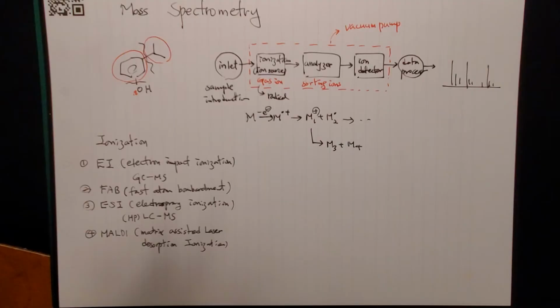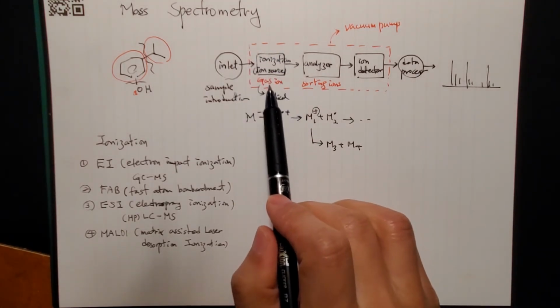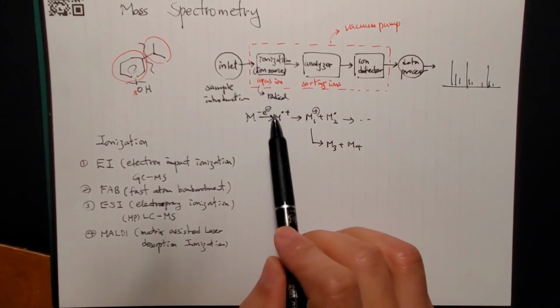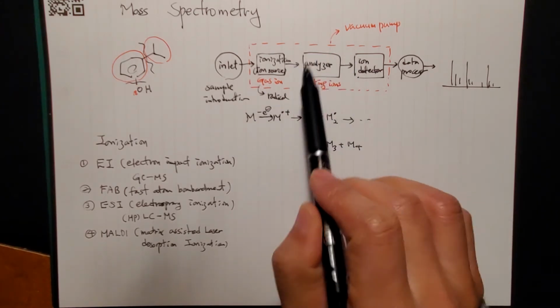This is one of the typical MALDI sample plates. MALDI is one of the latest advanced technologies, and you may find it in the lab most frequently. MALDI normally comes with a particular analyzer. So I'm talking about ionization methods, right? After you ionize them, they're going to fragment, so you need to sort them out using an analyzer.